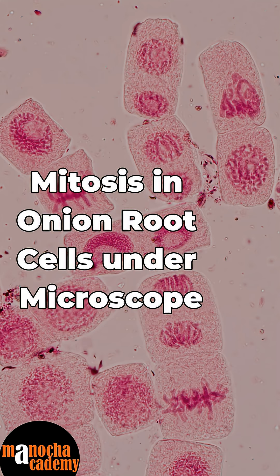So these are the different stages that you can see under the microscope for an onion root tip when you are observing mitosis.